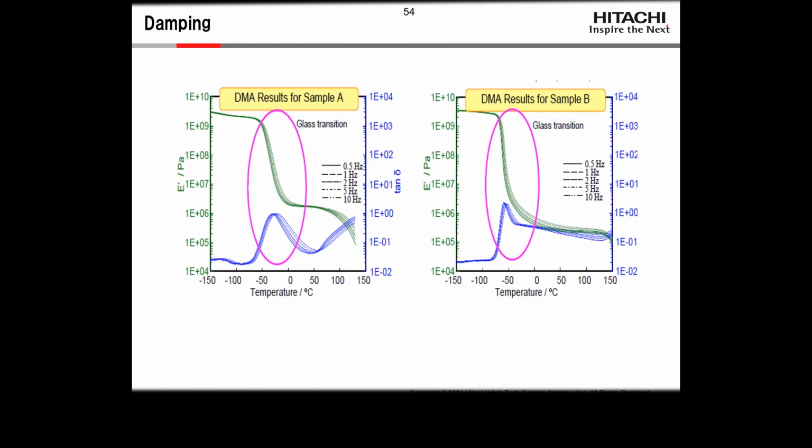Okay, damping. Damping, the tan delta, is the ability to dissipate energy. You can see here in two different materials, you get very different effects. If we are working up here in the rubbery range on both of these, this material is going to be much better at being a rubber than this one is, where the peak isn't as strong, isn't as localized. So there's a lot you can pull out on material properties from the tan delta curve too.